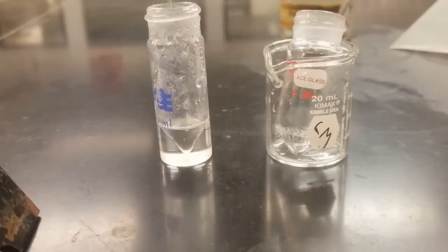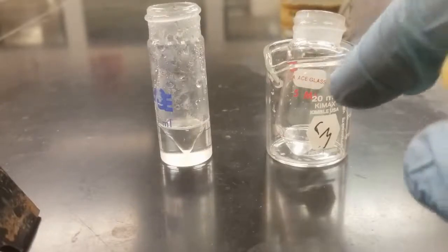And you want to try to not pick up any water, and then just go ahead and transfer it over. You can see I made my filter pipette a little too tight, and that's why the liquid's taking quite a while to come out. But it's actually a pretty good thing because when I picked it up, it made it go a little slower, which was more controlled. So overall, not bad. Cool. So we've got all of our DCM in here.